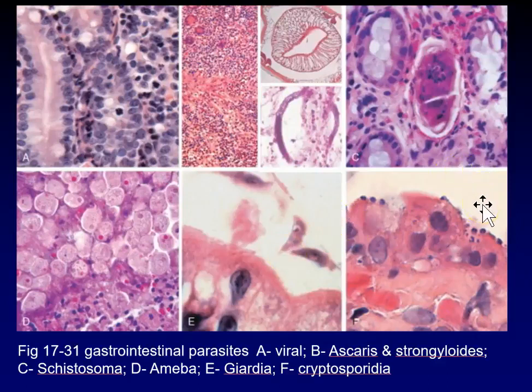Cryptosporidia. You can see the organisms here as the small dots along the epithelial surface.